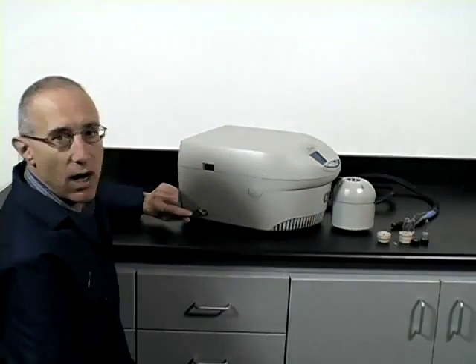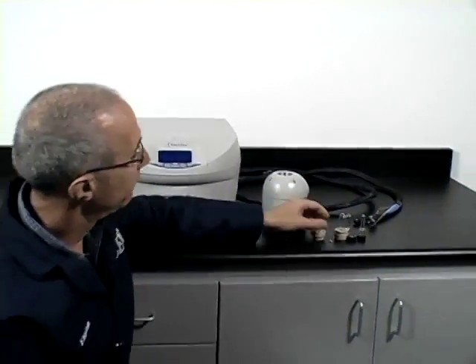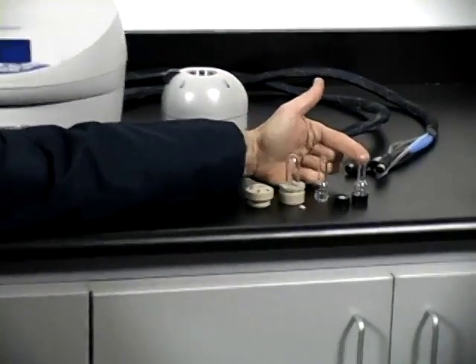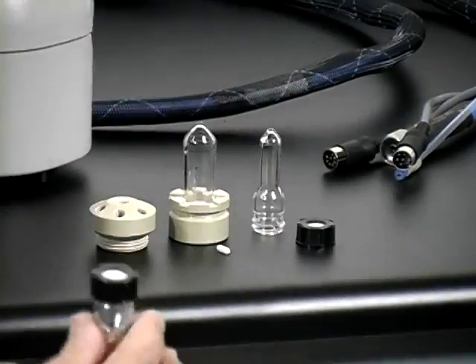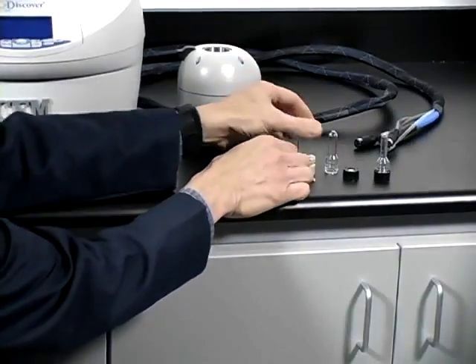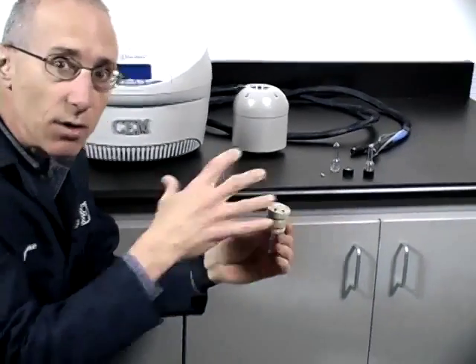On this side is the main power supply, and right here is where the cooling gas will come in. There are three vessel sizes that come with the system: a 1 mL vessel, a 2 mL vessel, and a 4 mL vessel. The vessels have a closure with a screw cap and a septa, or there is a multiport head made of PEEK. This gives you an idea of what the system looks like.